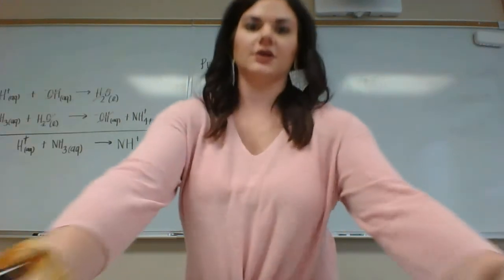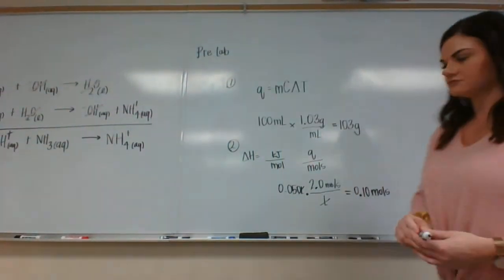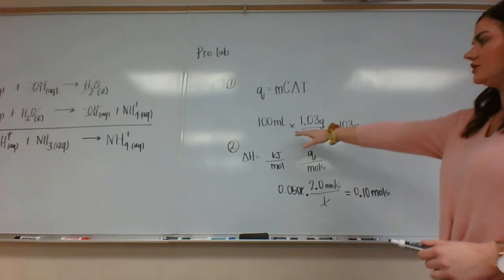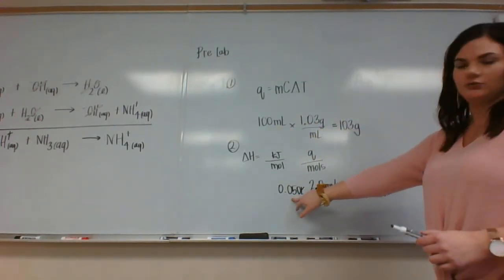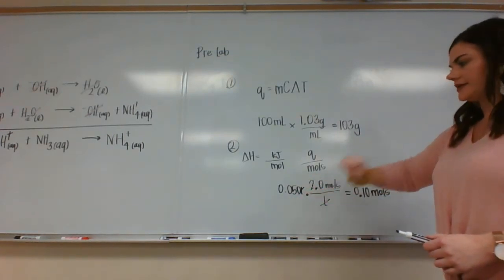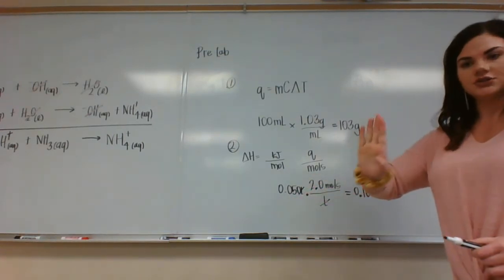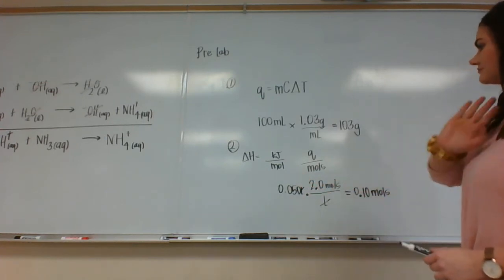I feel like you can't really see. Okay. So here we use the total volume. Here we're just using the volume per reagent. Never mind, just do it like this.